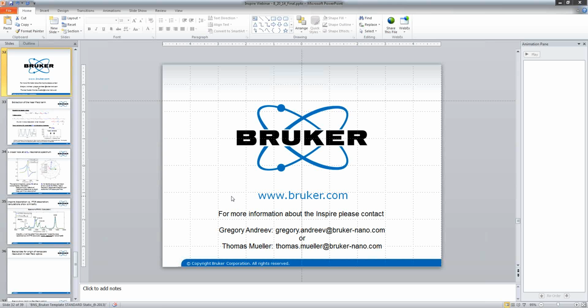Also, as I showed in the human tooth example, those are nanocrystals. I forget the exact crystal, but it's a calcium-containing crystal which has vibrational resonances around that infrared frequency. And it's possible to differentiate crystal from non-crystal.